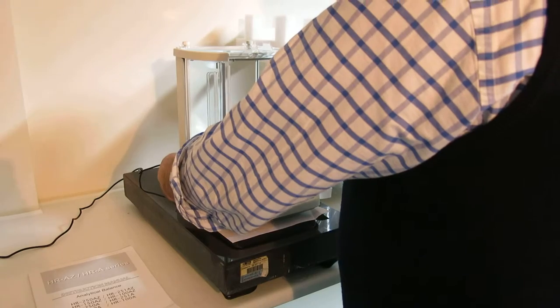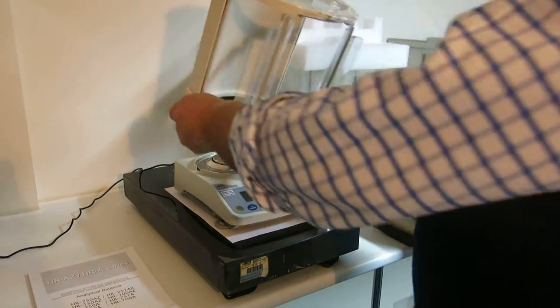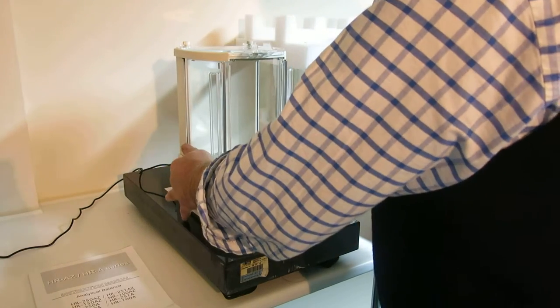First thing that's apparent is that it's very easy to clean. So you can see that it's got a removable draft shield. Put that back on there. Push that.